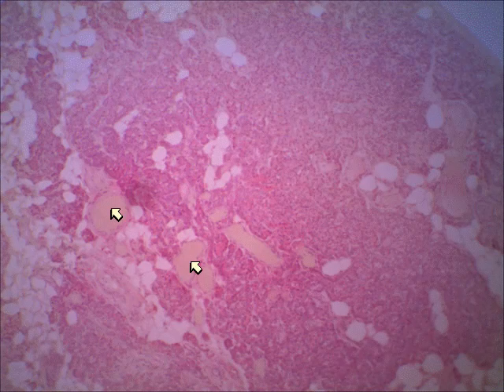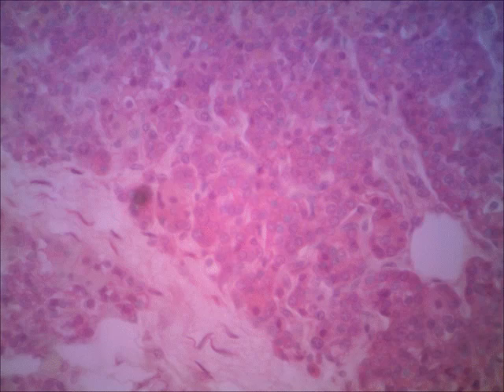You can see the follicles from the thyroid, but let's look at the parathyroid cells. All right, these cells tend to be arranged in little chains. You can write it in here. You can see the little chains of cells. That's how your book describes the cell arrangement, in chains. Here you can see it on a higher magnification. Notice the cells are clustered in little cord-like patterns, or I think they say cord-like patterns. So you especially can see that right here, like little cords or ropes.